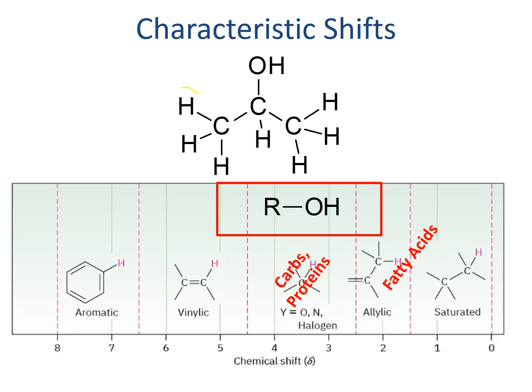Starting from the left side, we should be able to see these three hydrogens are identical to each other because they're all attached to the same carbon. This carbon is attached to the alcohol carbon, the one that's attached to an oxygen, but so is the carbon on the other side, and it also has three hydrogens. So these carbons are identical to each other, and therefore their hydrogens are all identical as well. But the hydrogen on the central carbon is different from the others, as is the hydrogen on the oxygen. It's the only hydrogen on that oxygen.